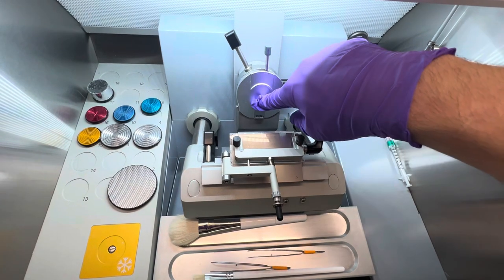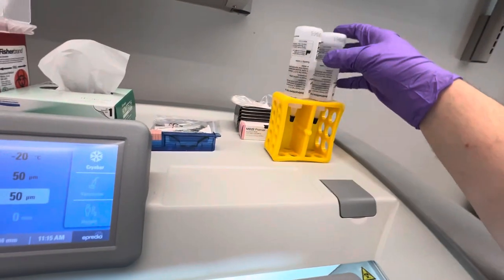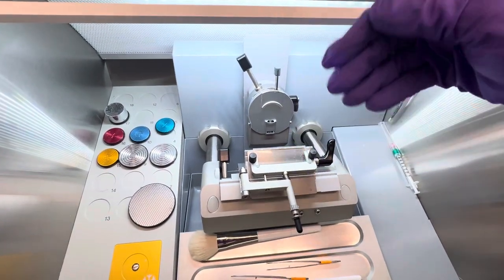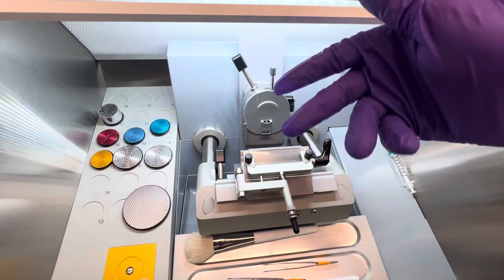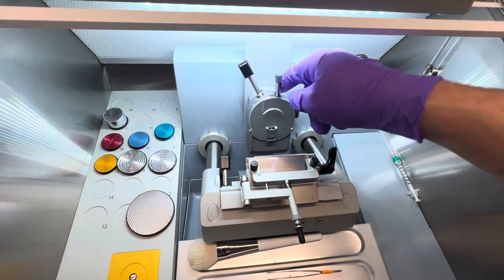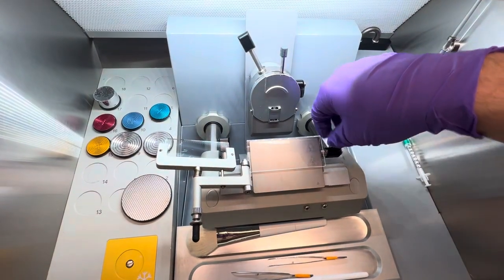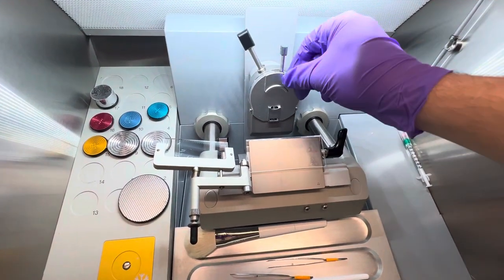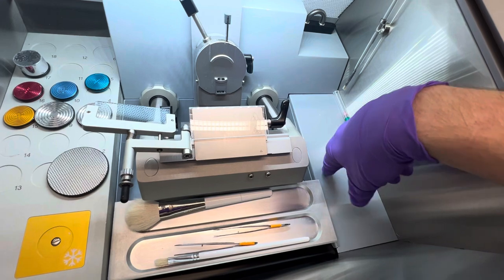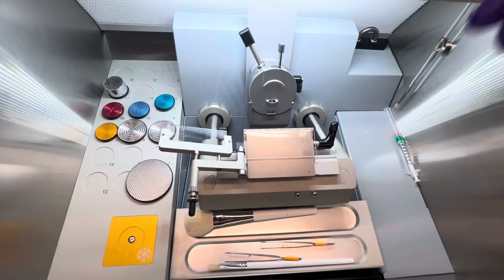Again, the specimen head is where you put the chuck, and the chuck is what holds the OCT block once you freeze it to there with more OCT, which in this case we have up here. You would just take the cap off and squeeze it on there in a relatively continuous motion, because if you do it off and on, it'll create bubbles and you don't want that. And you'll freeze it to there, attach it on here, lock it in, take off the hood, put in the blade, clamp it down, make sure it's secure, and double check that the specimen head's secure. I'm not going to touch this, but usually your tools would be over here on the tool shelf.